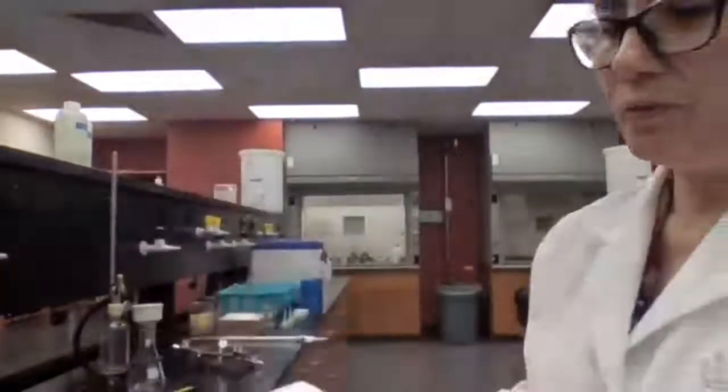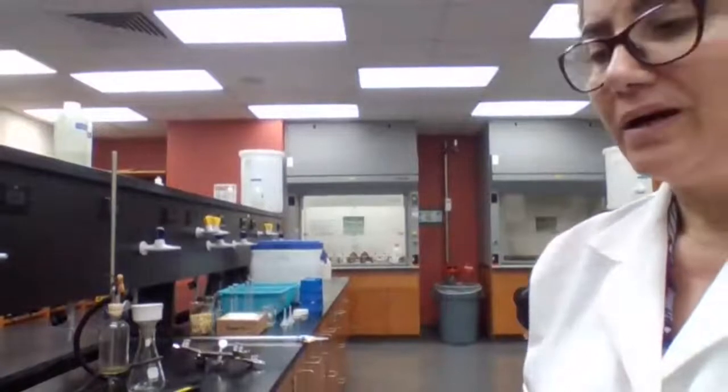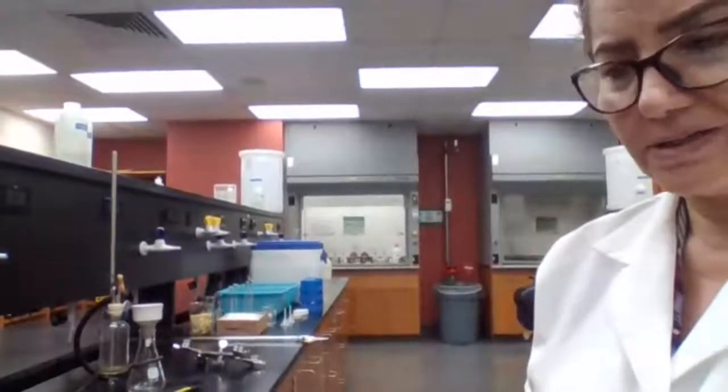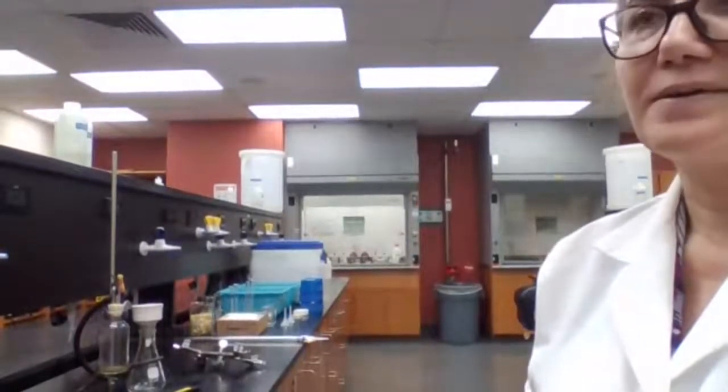If you know you have a carboxylic acid, in order to find which carboxylic acid it is, is it acetic acid, is it hexanoic acid, is it benzoic acid, what's the name of the carboxylic acid, all you can do is find the molar mass for the carboxylic acid. When you have the molar mass, based on the molar mass, you can decide the structure of the carboxylic acid.